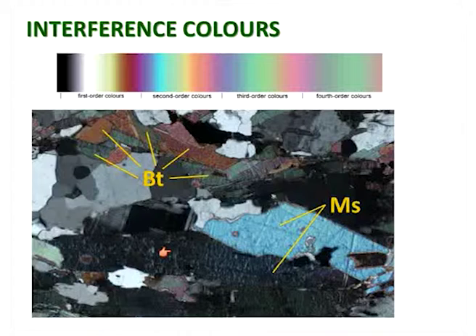In fact, this shows pretty much exactly the same sort of extinction as calcite. It's bird's eye extinction again. So if you look in here, you can see it's got a kind of texture to it again, and you can see that it's not uniformly black. It's not quite straight, to be fair, but it is not uniformly black. You've got these speckles of white and pale grey all the way through it, and so that is very characteristic of mica as well. So both the micas and calcite show this bird's eye extinction, and it can be extremely useful for telling micas apart from other minerals.